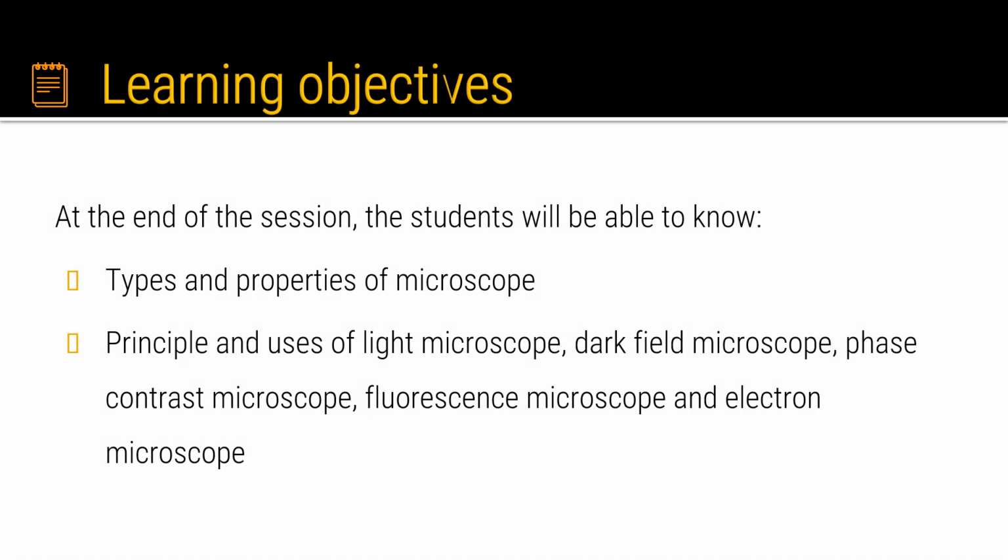First, the learning objectives. At the end of this session, you will be able to understand the types of microscope, the principles of light microscope, dark field microscope, phase contrast microscope, fluorescent microscope and electron microscope. So today I'll be dealing with only light microscope.